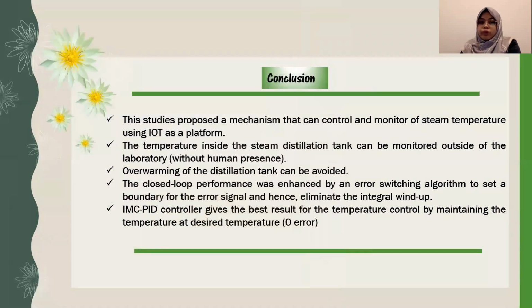As a conclusion, this study proposed a mechanism to control and monitor steam temperature using IoT as a platform. The temperature inside the steam distillation tank can be monitored outside of the laboratory, which means we don't need to always monitor the temperature inside the laboratory.